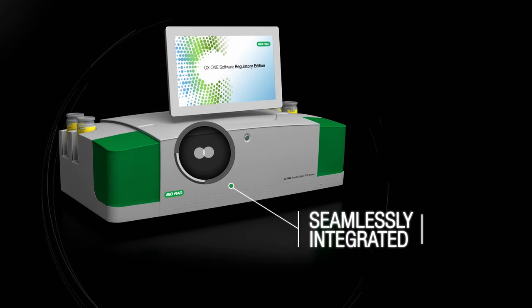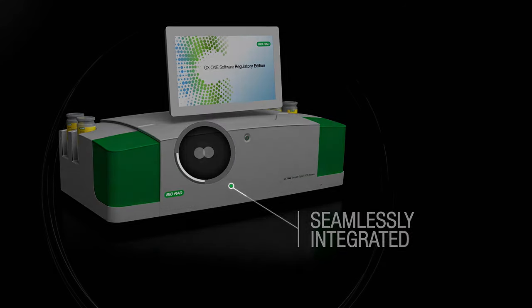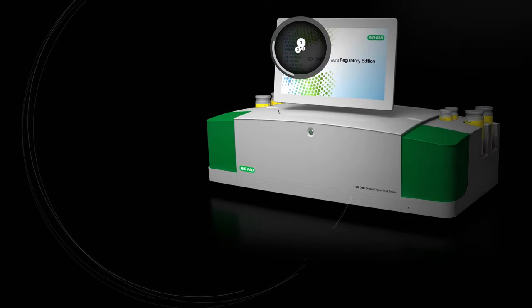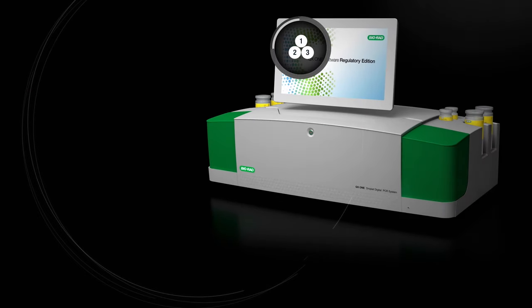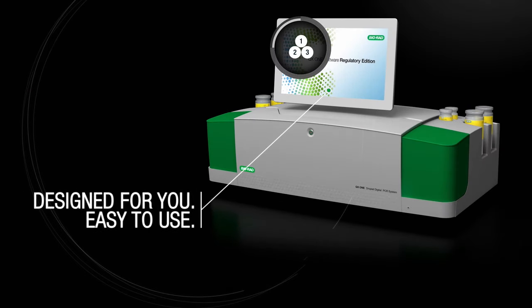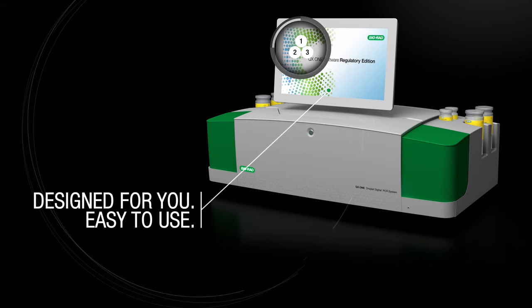Operating with existing supermixes, assays and kits, the QX1 is designed for you. And just like our other systems, you can be confident in its precision and accuracy.